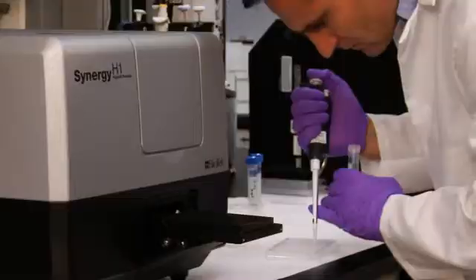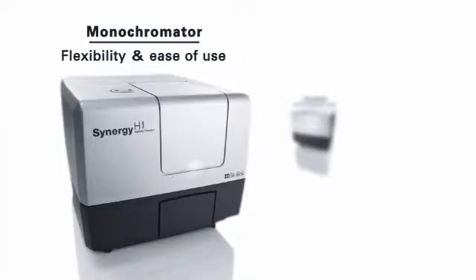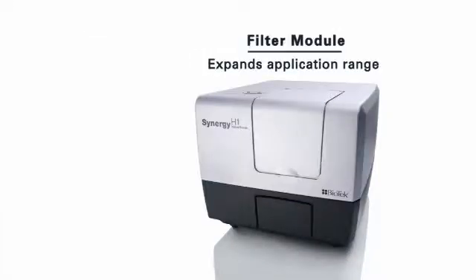This unique patent-pending combination of monochromator and filter-based optical systems covers a very broad range of applications in a compact, cost-effective instrument. Monochromators provide ease of use and flexibility, while the optional filter module greatly expands the application range of the instrument.